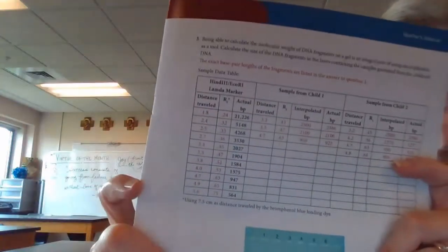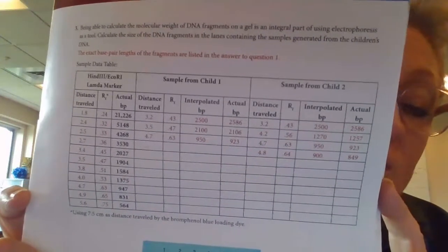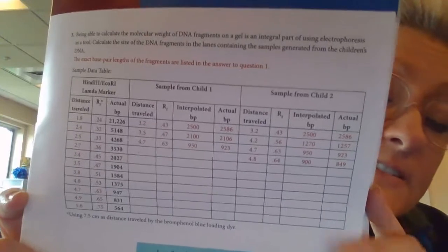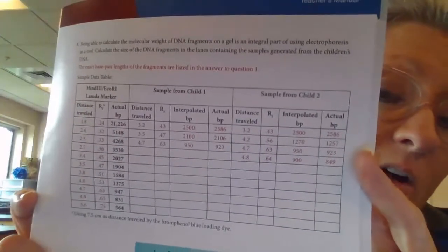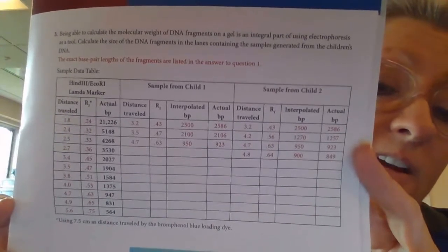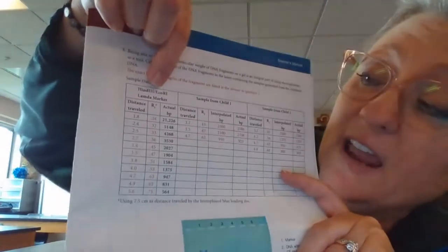So we filled out our little chart, and I'm going to show you the answers. There we go. So here are the answers to that chart. So if you want to do a little pause, make sure that you can read that. I'll hold it really still. There you go. You should have the distance traveled and the RF for the marker DNA.